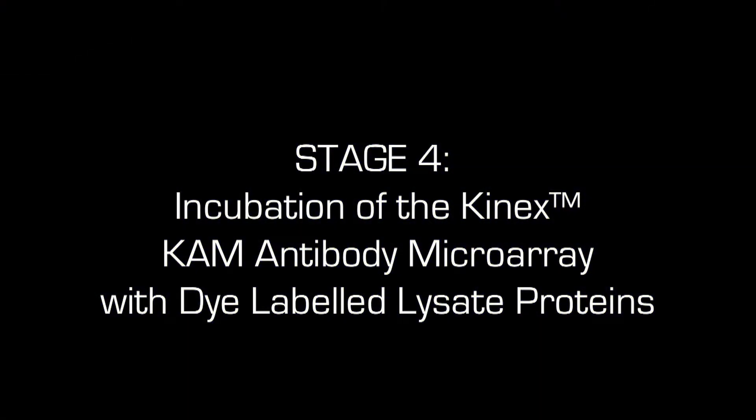In this video we demonstrate how to incubate the KAM antibody microarray with two samples of dye-labeled lysate proteins and how to remove proteins that are not captured by the antibodies on the microarray.